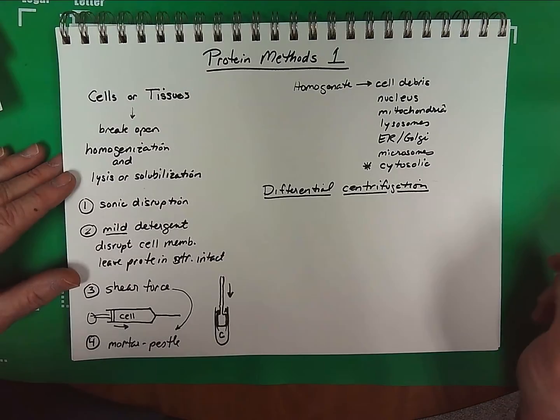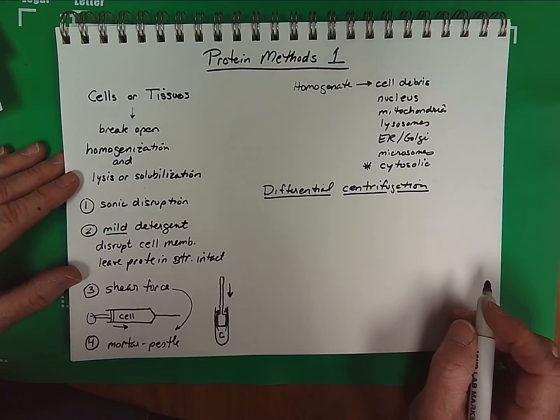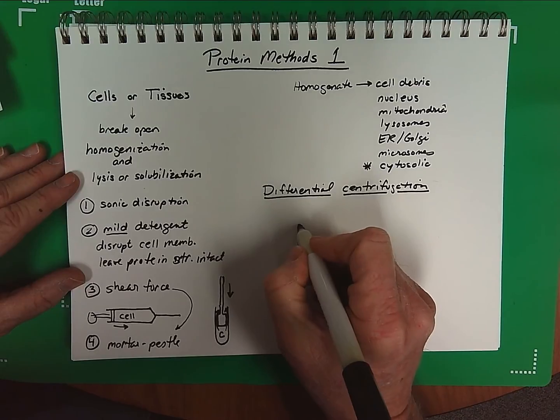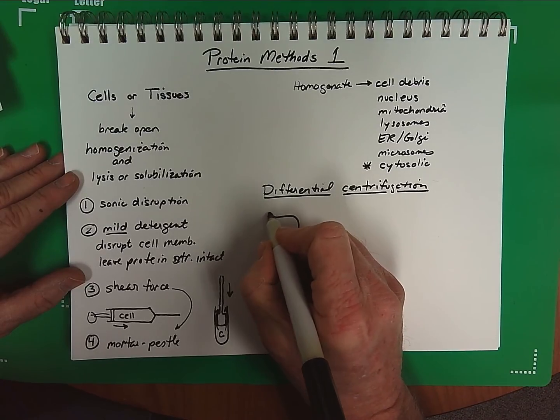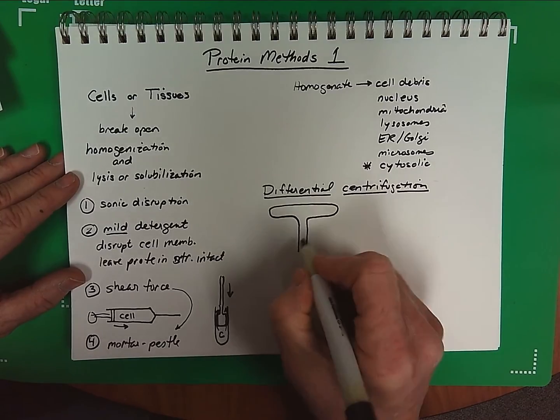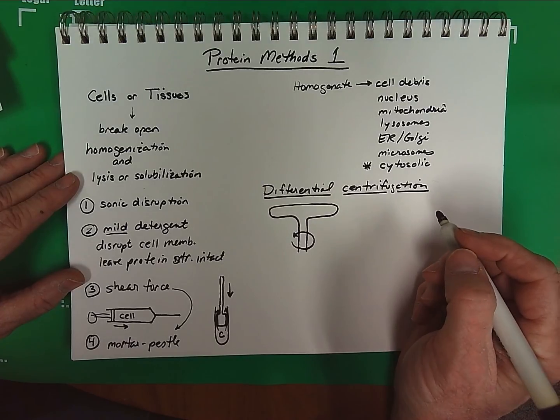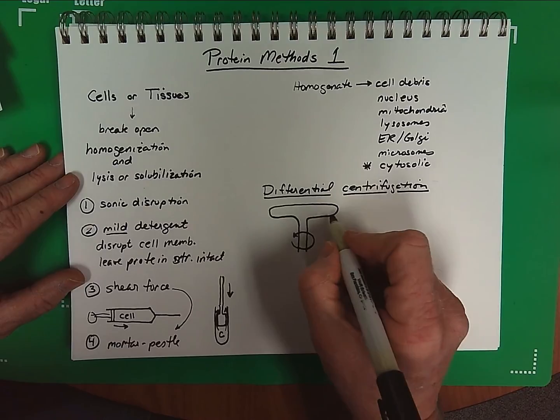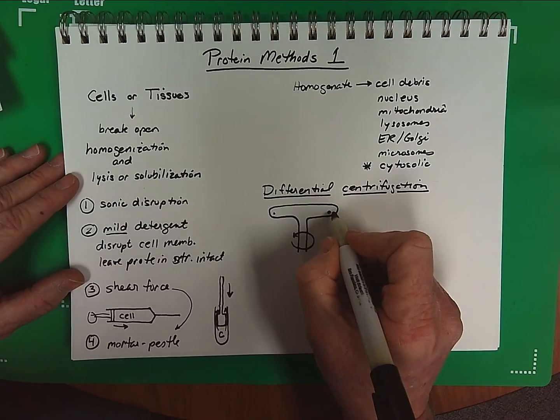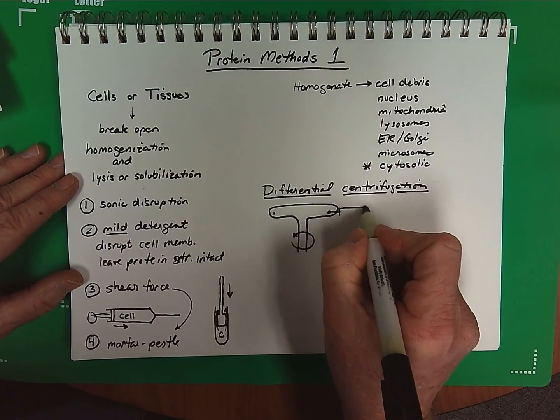Now, centrifugation is a very simple principle, although the equipment is very sophisticated. We will typically have, for example, a rotor that fits into a centrifuge, spins around a central axis, and we have what are called swinging buckets that are attached to the ends of the rotor. And so what these do is support test tubes.